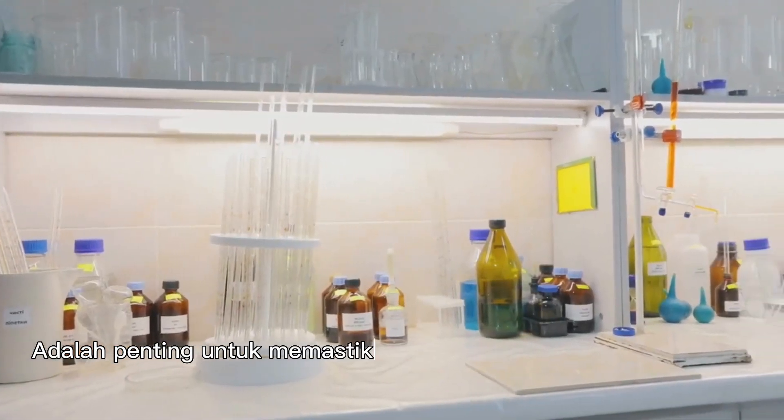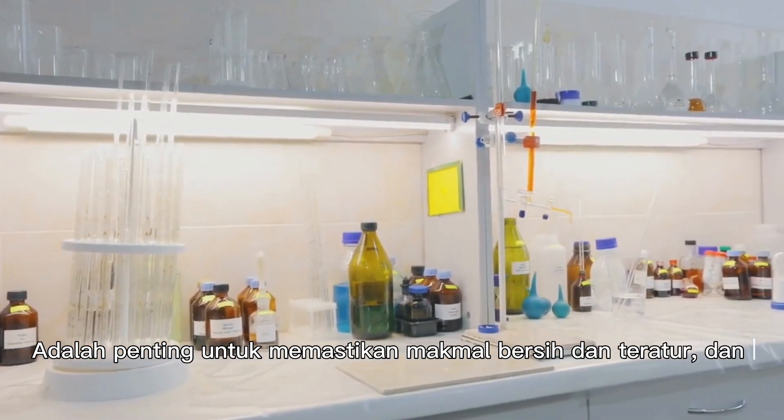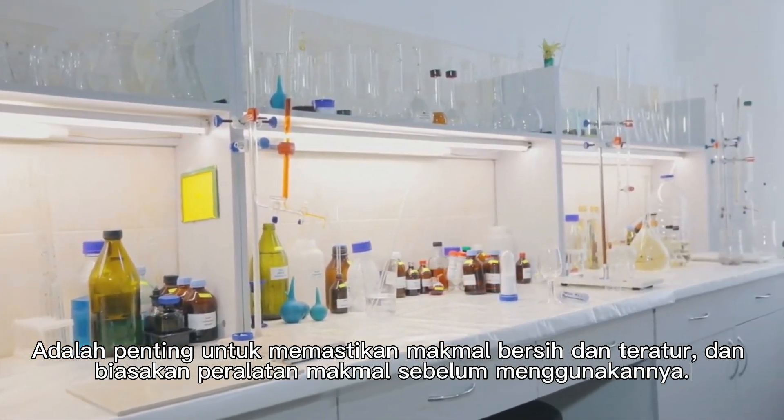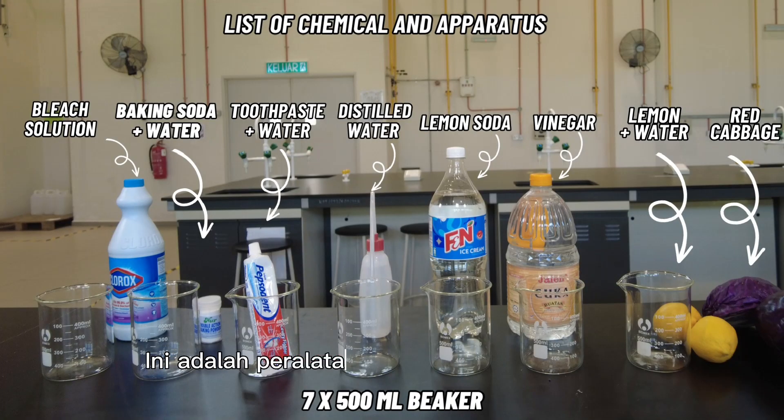It is crucial to keep the laboratory clean and organized, and to familiarize yourself with the laboratory apparatus before using it. These are the apparatus that we are going to use.